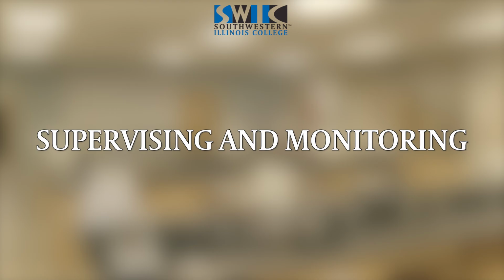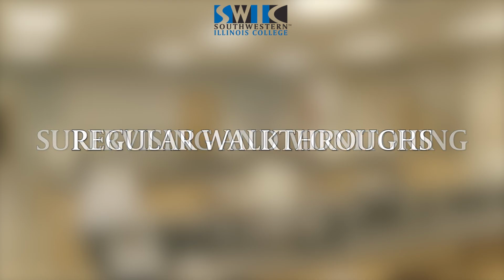Actively supervise your students. Keep a close eye on their actions and intervene if you notice unsafe practices or deviation from the protocol. Conduct regular lab walkthroughs. Check that safety equipment is in working order. Chemicals should be properly labeled and stored, and you should make sure students are following safety guidelines as well.